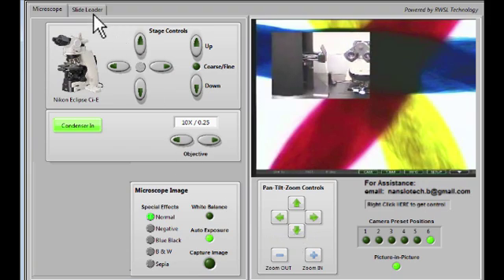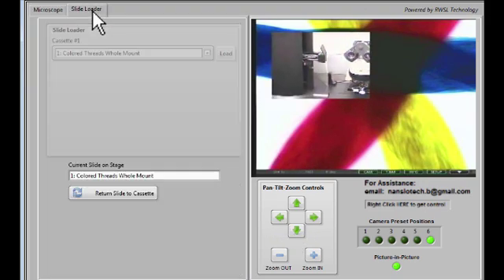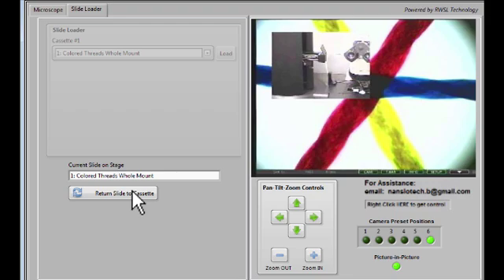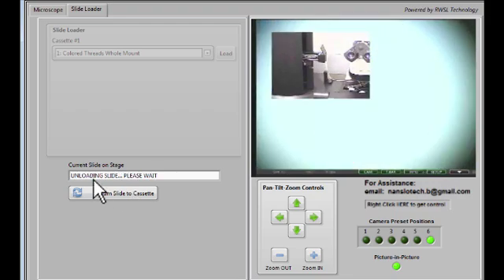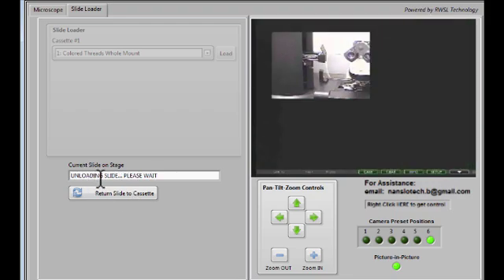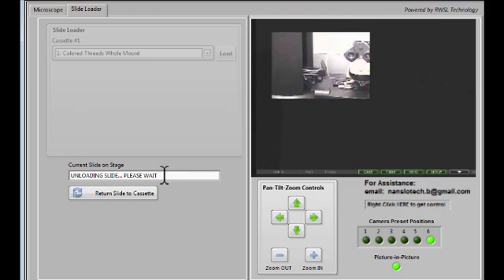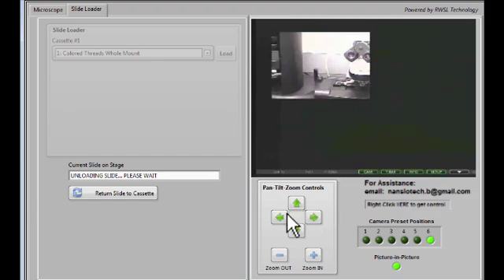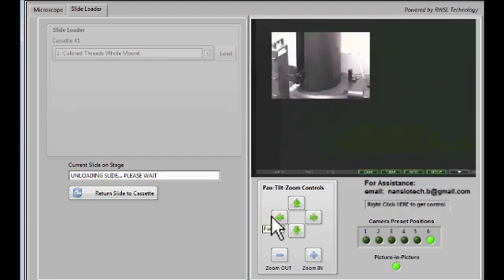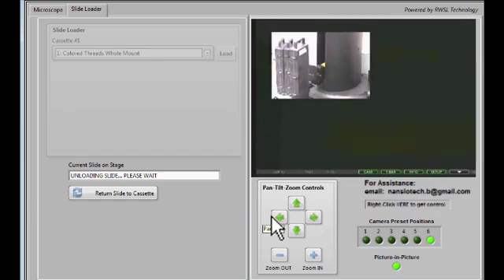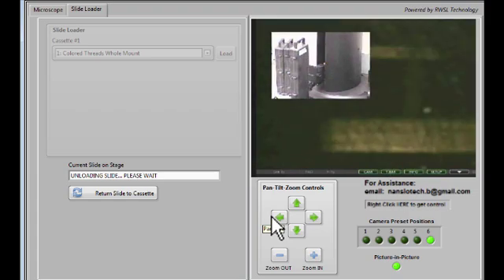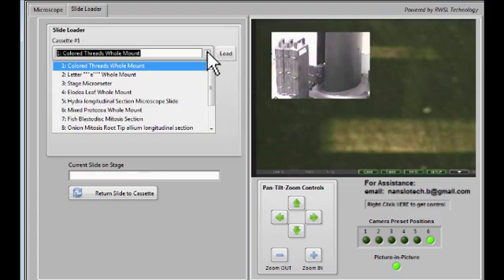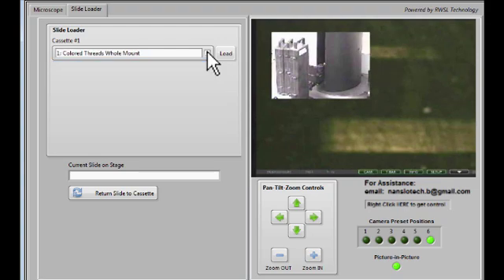When you're finished with the slide, go back to the slide loader tab and click return slide to cassette. Notice the message to wait while the robot is busy and you can also watch it in the picture-in-picture camera. Now you're ready to select a different slide and go on with your procedure.